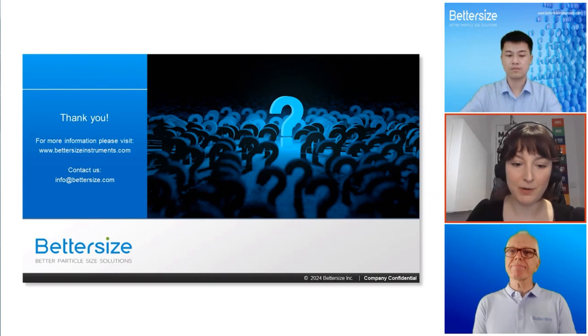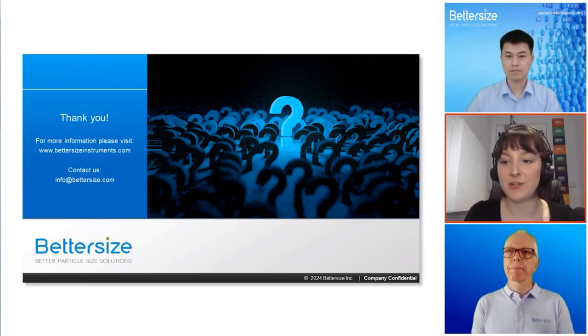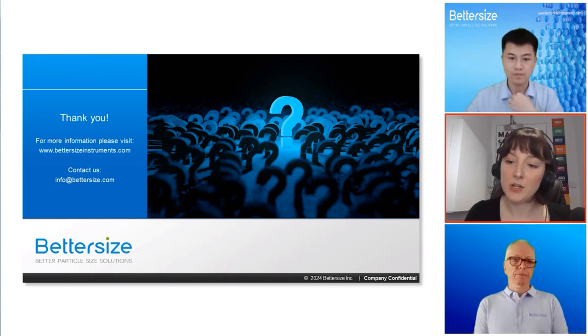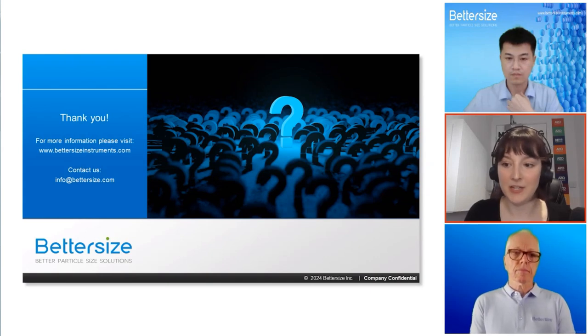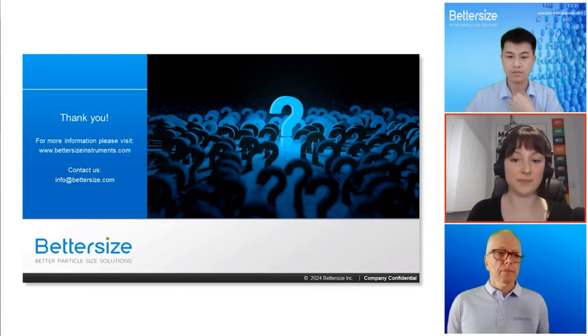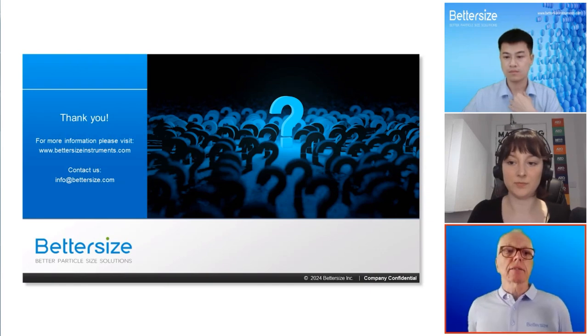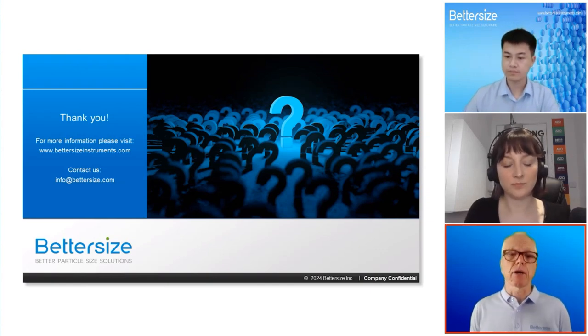And John, just staying with you for one more question. You highlighted the importance of zeta potential in predicting the stability of pharmaceutical suspensions. Could you discuss how variations in pH and ionic strength might affect zeta potential and consequently the stability of a drug formulation? Yes, so zeta potential can be highly sensitive to both the pH and the ionic strength.